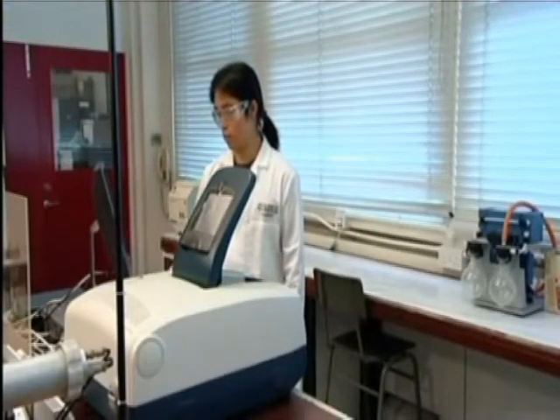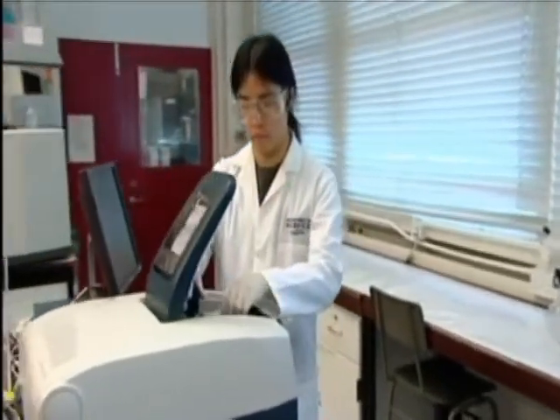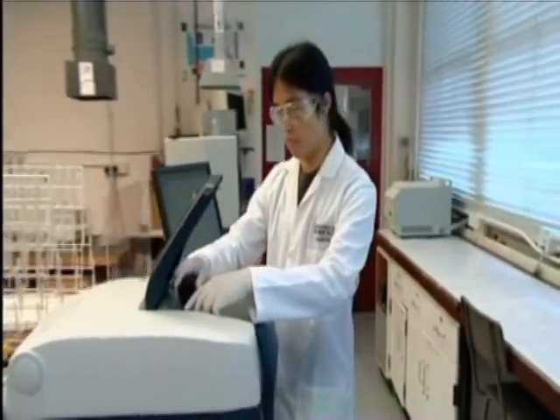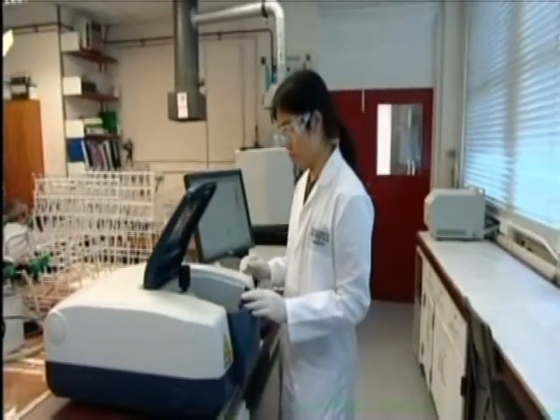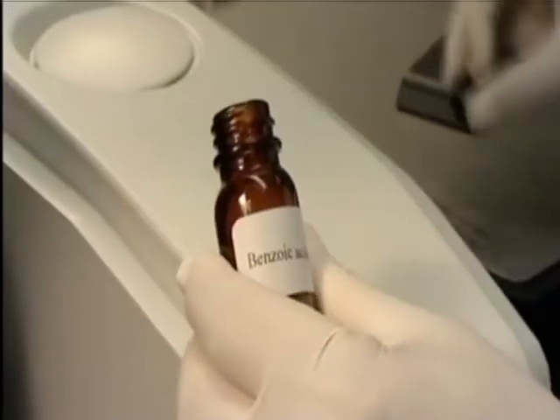Here, we will run the IR spectrum of solid benzoic acid. The instrument is switched on, and a blank is run with no sample in place. This is to find the absorption of the air, which must be subtracted from that of the sample.